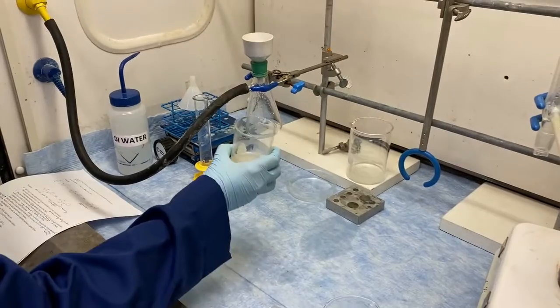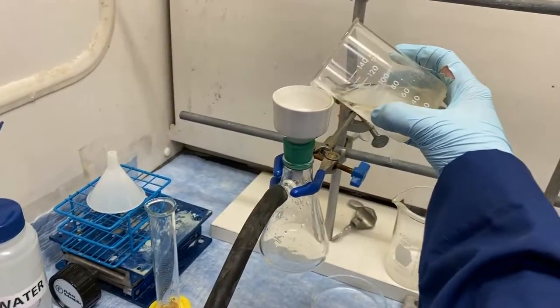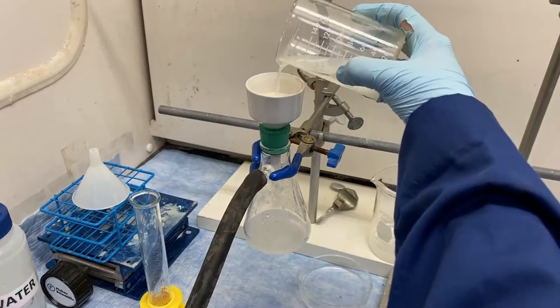Okay, so now we've gone our 10 minutes. Now we're gonna go ahead and filter this out so we can get our product. Okay, pouring it slowly.